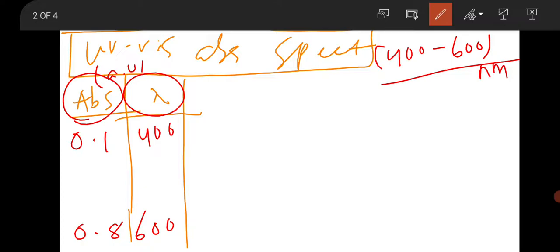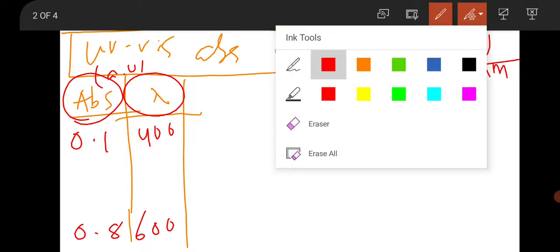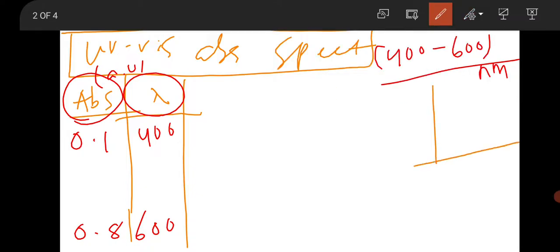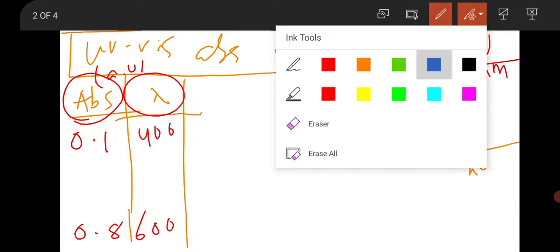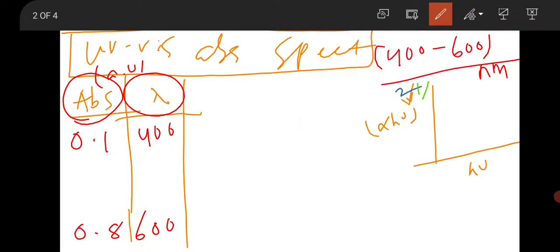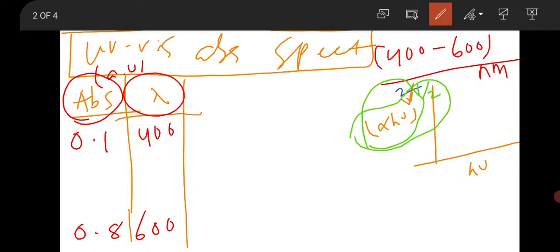In order to get the bandgap, you have to draw the Tauc plot. The Tauc plot is a graph of alpha·hν to the power gamma versus hν. This gamma has specific values: if it is a direct bandgap material, then you have to square this term — (alpha·hν)² — and if the material is indirect bandgap in nature, then you take the square root — (alpha·hν)^(1/2).